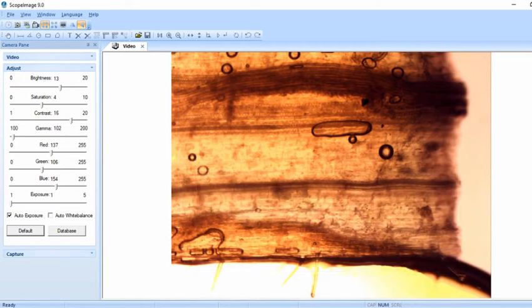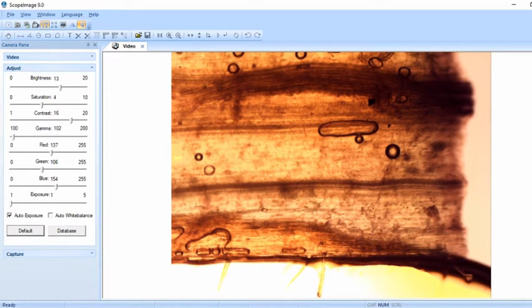Hello everybody. This is going to be a bit of a different video and a bit of a quick video. This is actually my microscope program that I use for doing live stuff. However, it can no longer record video for some reason. It's really dumb. Anyways, so I'm using my screen capture software.